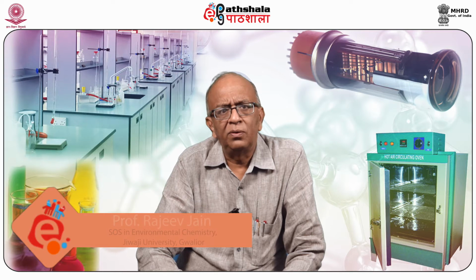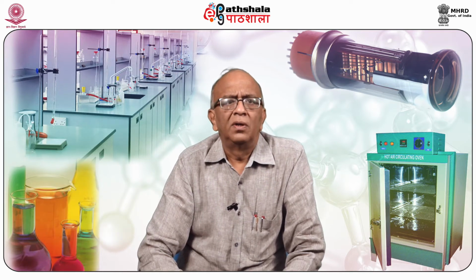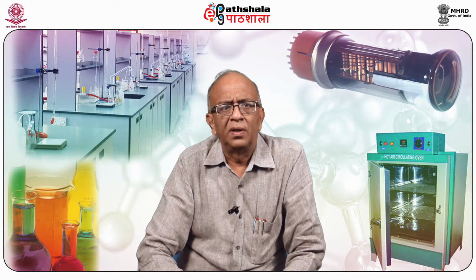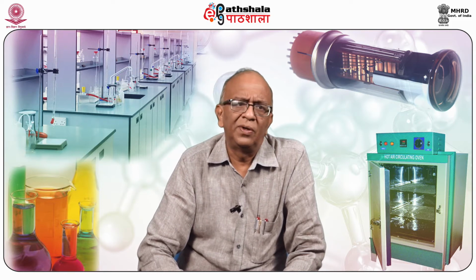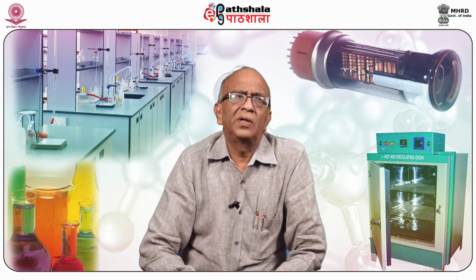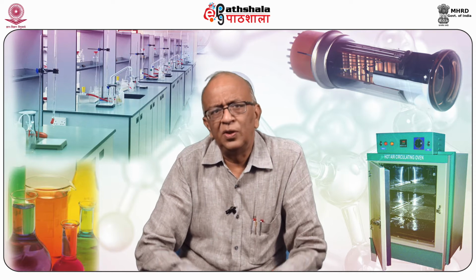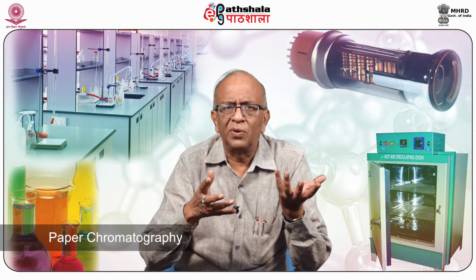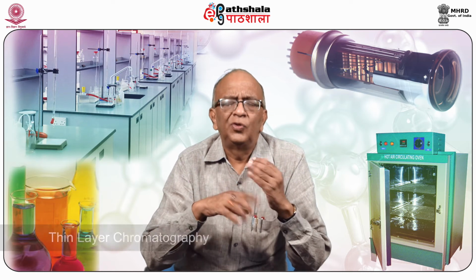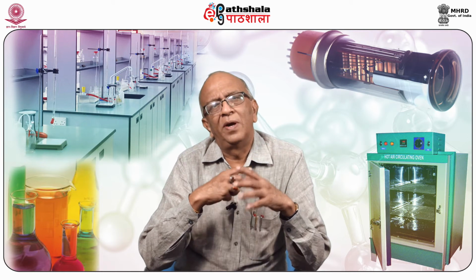Today we are going to discuss a module, Chromatographic Techniques 3, under the paper Fundamentals of Analytical Chemistry. Today's learning objectives, which we shall study in this module, are paper chromatography and thin layer chromatography. How paper chromatography was developed.